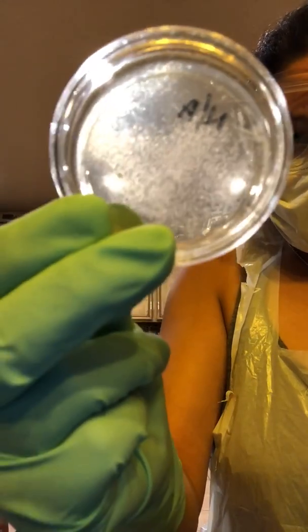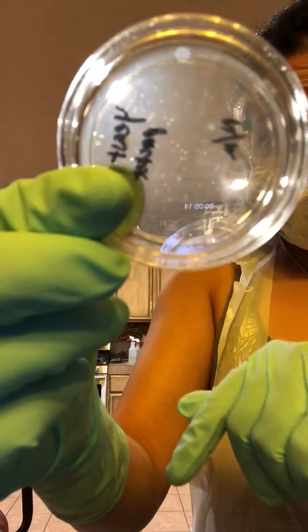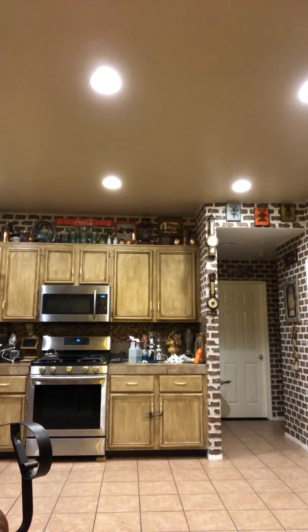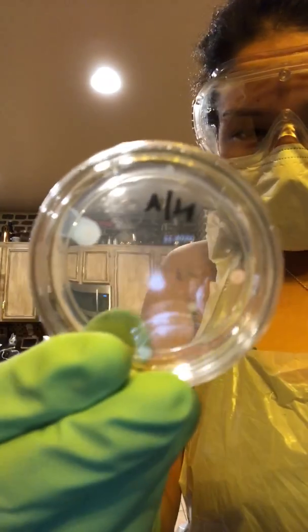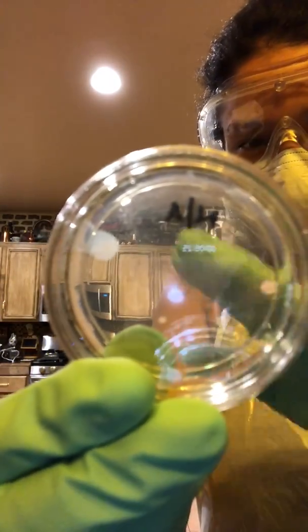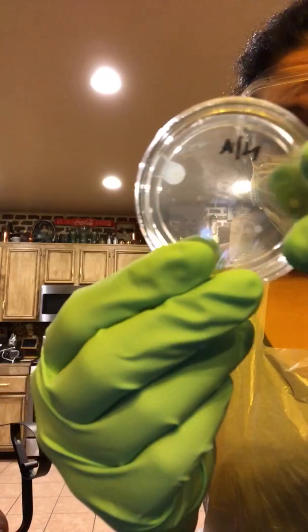Then we go to number 3, to number 4, and you can see how it starts slowing down in its growth. Number 5, you could barely even see. Number 4 was a lot more. And then number 6. Here I think I placed it a little too much on one side, but you can see how slow the growth was for this one. It might have been contaminated as well. But that was my 1, 2, 3, 4, 5, 6.